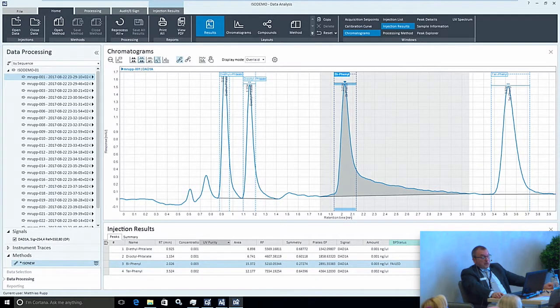Those green columns actually show custom calculations. They do not exist in a standard system. They exist as part of a specific custom calculation that I have defined. So this column actually shows a final corrected amount.